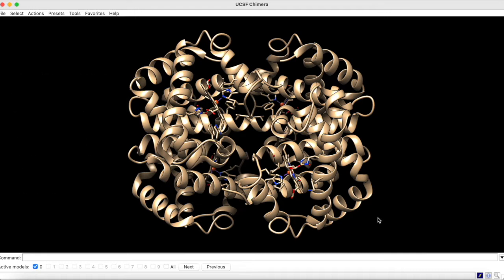In this tutorial, we will explore some of these capabilities by creating a short animation with the hemoglobin structure 4HHB.